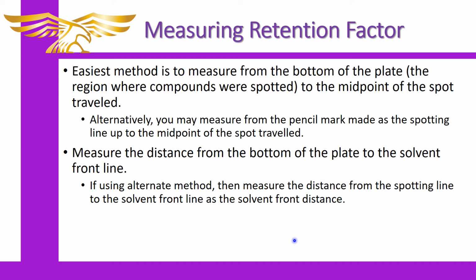Measuring a TLC plate is relatively easy, and we measure the plate in order to calculate retention factor of our various compounds. This is a method that we use in order to determine the resolution of a separation, and it is effective and works fairly well for TLC. It doesn't always work well for other chromatography methods, however.